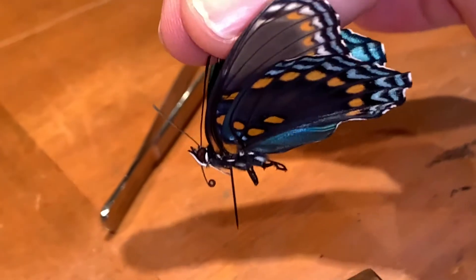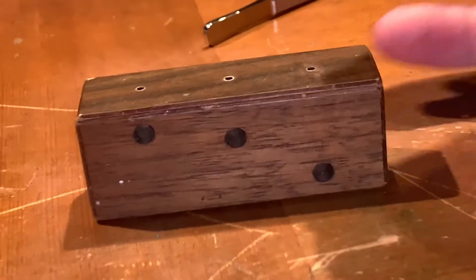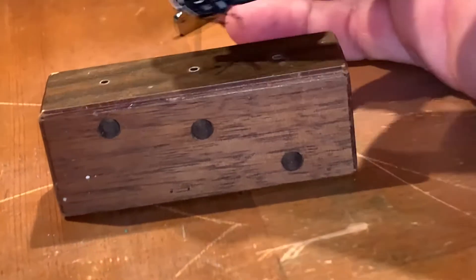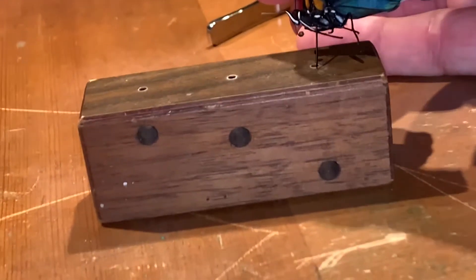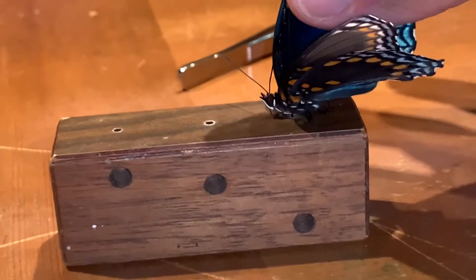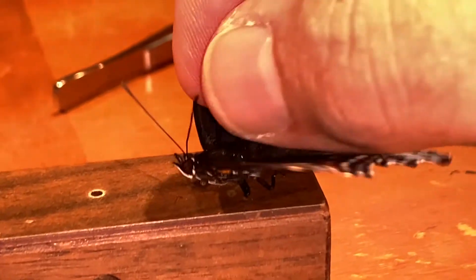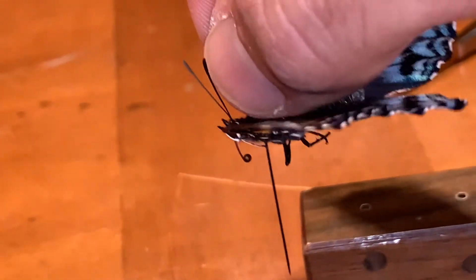Now I've got my butterfly on my pin — it looks straight, going in the middle on the top and coming out the middle on the bottom. Then the pinning block has three holes: two shallow ones for labels and one deeper hole that measures how deep on the pin the butterfly's body goes. You push the pin all the way down until it can't go further, and now you can see just a little piece of pin sticking out. All the rest of that space will be used for the labels and to pin the specimen into the box.